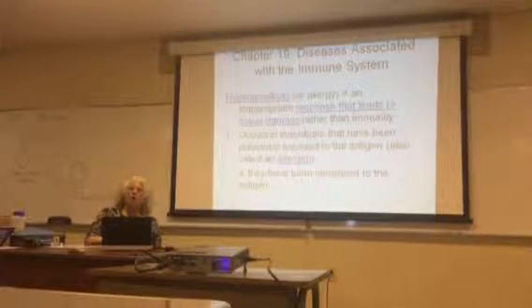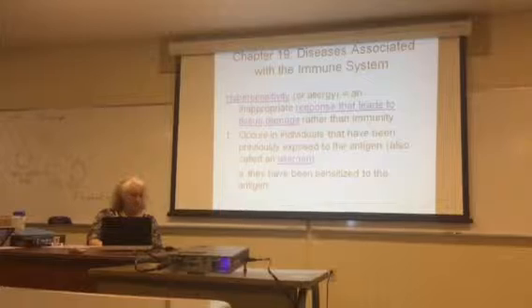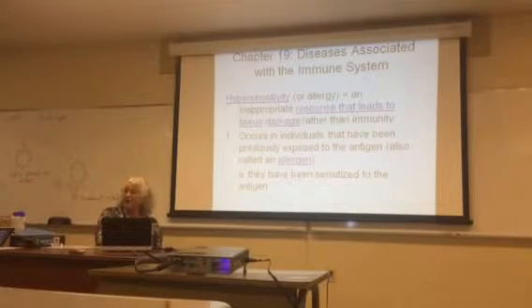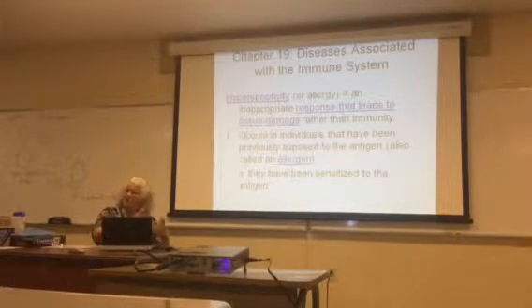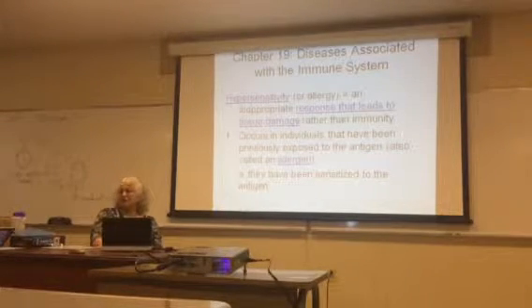And that lab will be on all these media, selective and differential media, the IMVIC test, all this stuff we've been doing, and you need to know what media selects for certain things and what genus and species of bacteria, which on some of them is pretty evident.